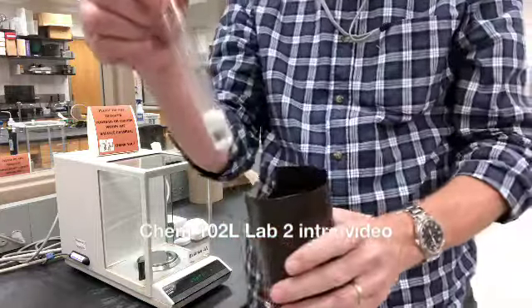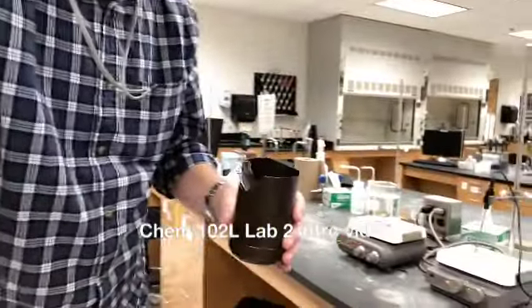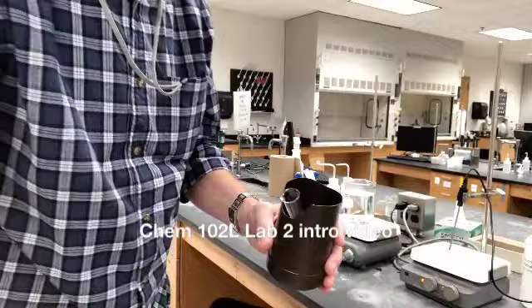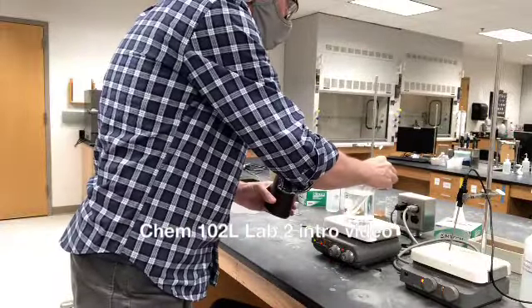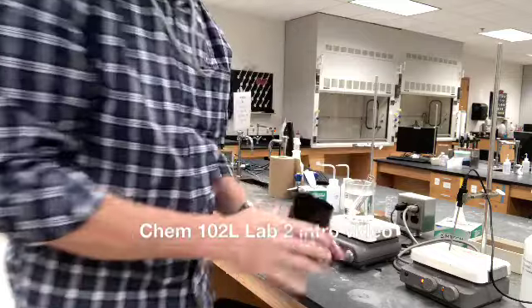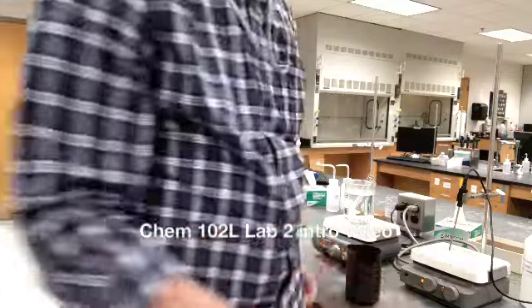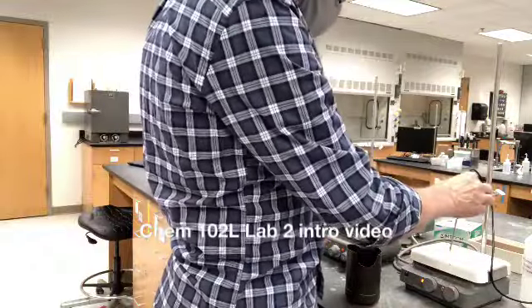Okay, so now that is what we're going to have as a mixture, and that's going to come over here, and we can use our hot water bath to melt it. And we'll put that over here on our apparatus. We can slip our test tube in there.